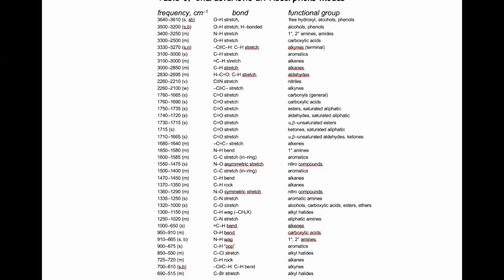So the infrared spectra does give us a lot of information about the molecule. Specifically, it tells us about the functional groups present. You'll often be given a table like this one here that gives us some identifications for what functional group is going to give a signal at what frequency or wave number. And so you see there that the OH stretch is around 3,600, and that tells us about alcohols and phenols.